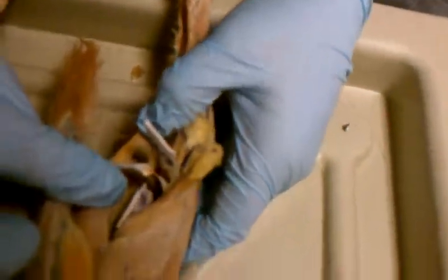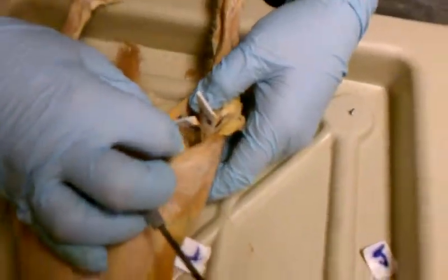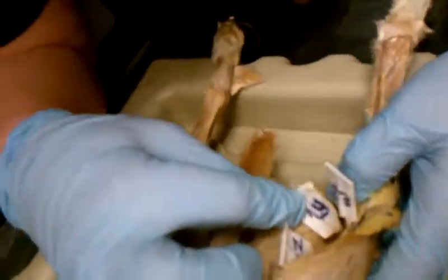And then do you want to do the back? Yeah. And if these are the only ones we need to know for the back, I'm good. Popliteal is the one coming down. The femoral comes around, loops around the back of your knee and turns into the popliteal. And I can't see a blasted thing. Why is that? What's happened? I could see it yesterday.